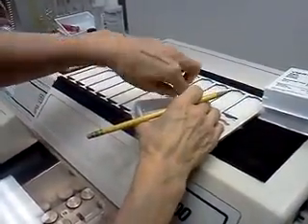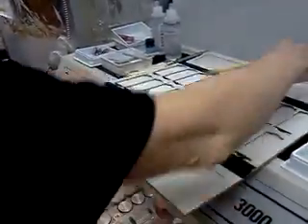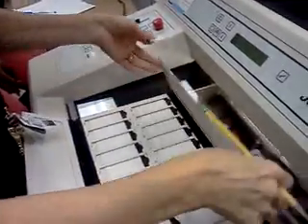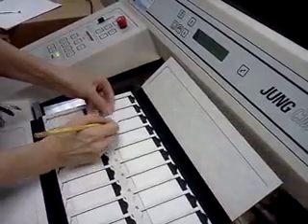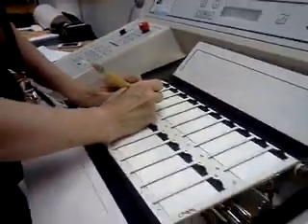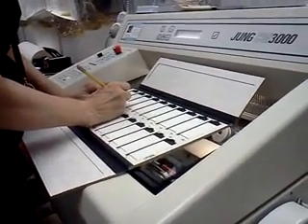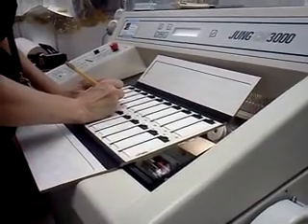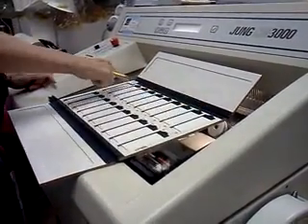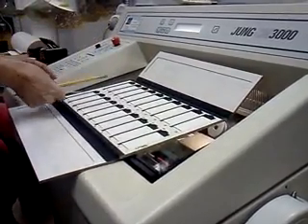Okay. So you're going to be cutting tissues. And you make up your mind what you want to cut, and you set these up ahead of time. And this thing is going to hold your sections as you cut them. So, for example, let's say we're going to do 275, and this is adipose. And then we're just going to put section 1, 2, and then you just get all your slides ready, 3, 4, 5, 6, 7, 8, 9, 10, or whatever, or you can label them afterwards.